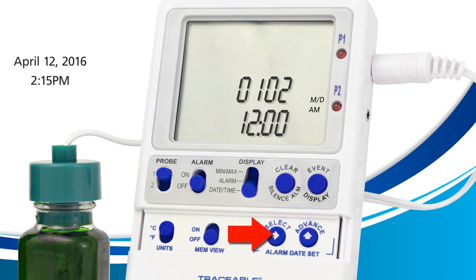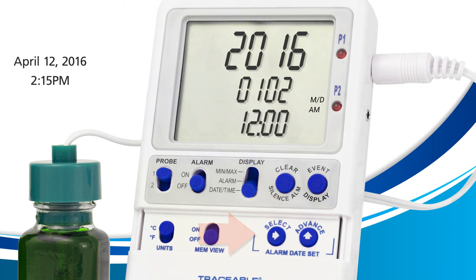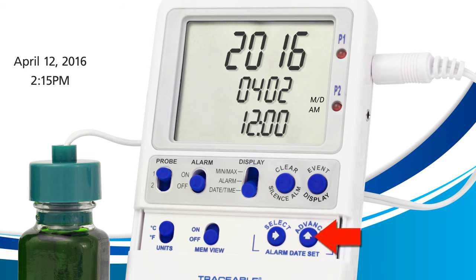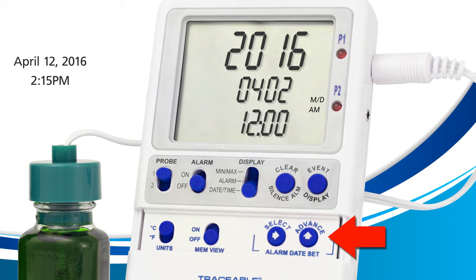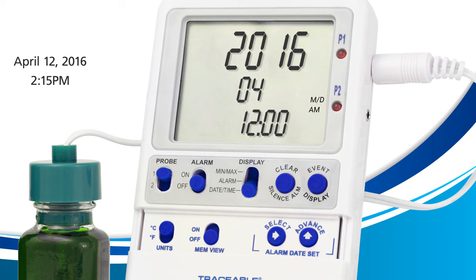Now we're on the month field. Press the advance button until you reach the number 4 for April, then press the select button to move on to the day field. Here I need the number 12, so I'll press the advance button until I reach 12. Once it's at 12, press the select button to move on to the last row.